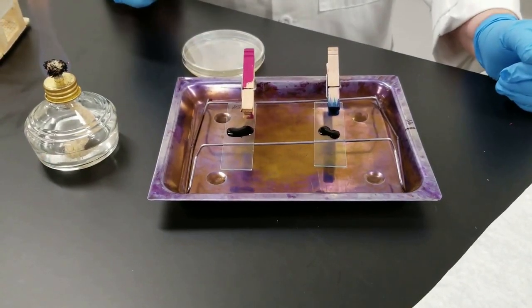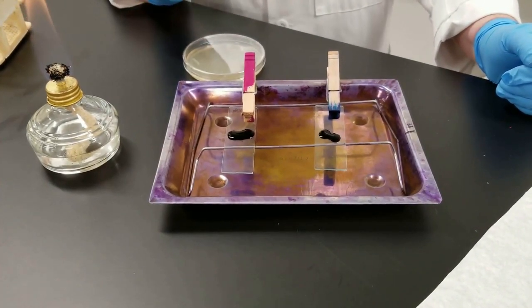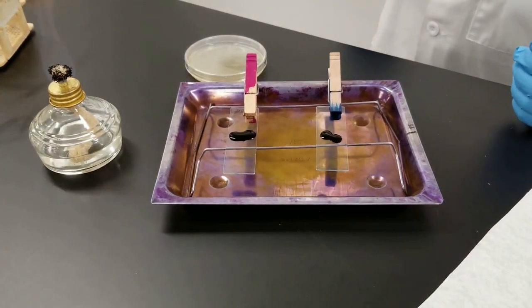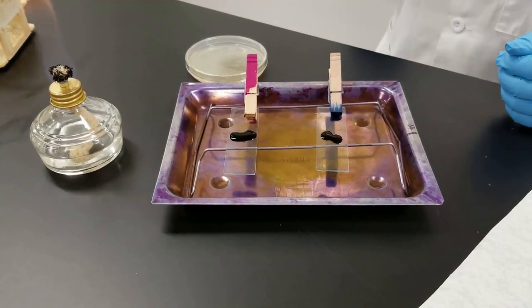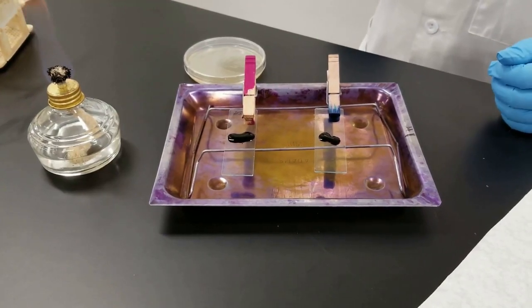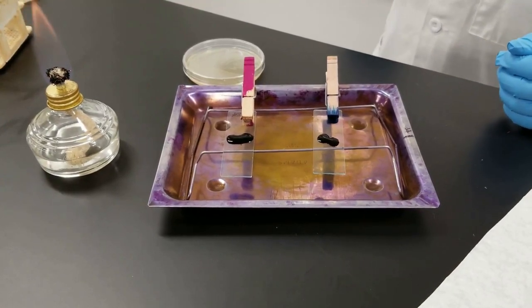The timing on this is critical. The Gram stain is going to use, as I said, two different dyes so we can distinguish between organisms. The first dye, or the primary stain, is this crystal violet. All the cells are going to look kind of a bluish purple color if you were to look at it right now under the scope.